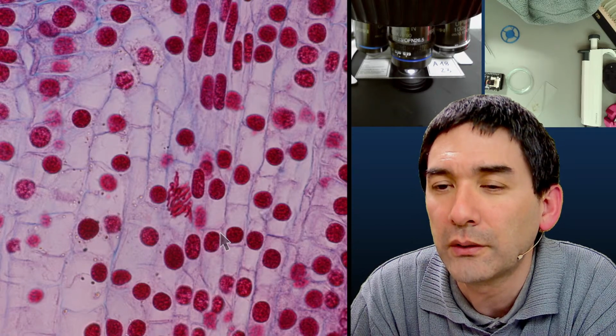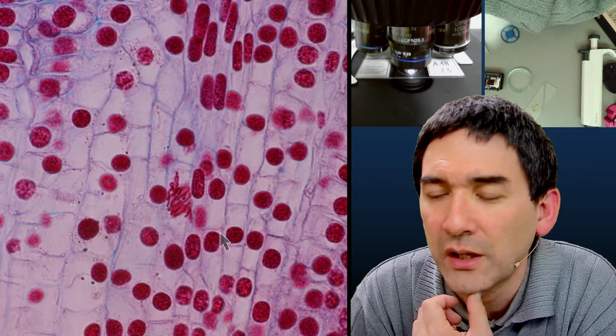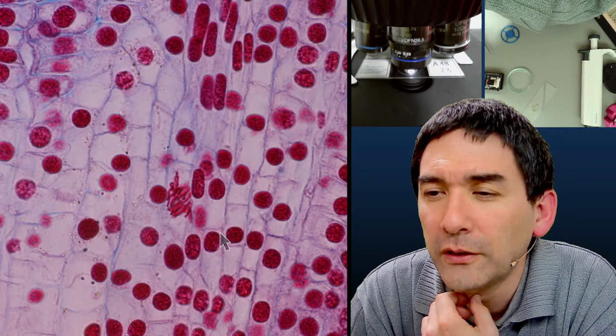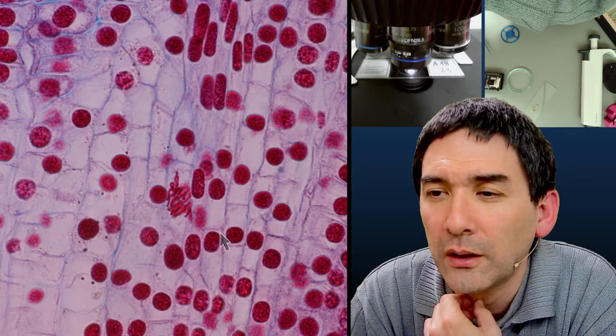Thanks for the info regarding dark field. Interesting. I suppose this has to do with import issues or so. I don't know. But for dark field, you have to fully open the diaphragms and give full illumination. It does not work at all on all magnifications.